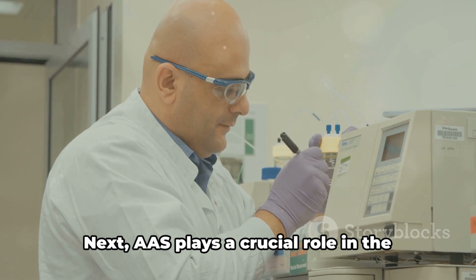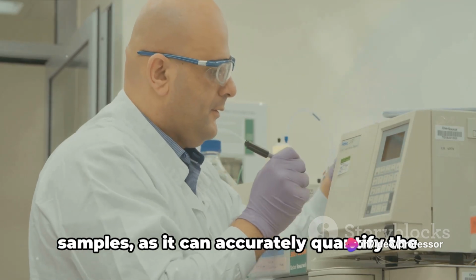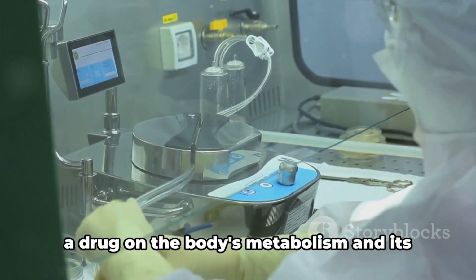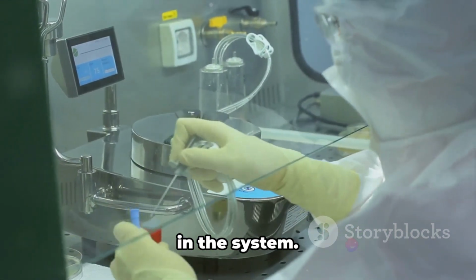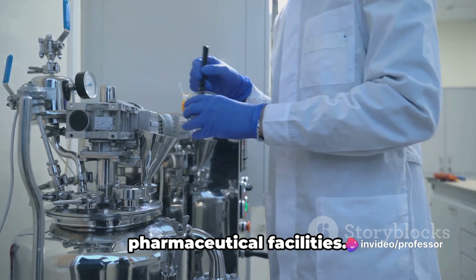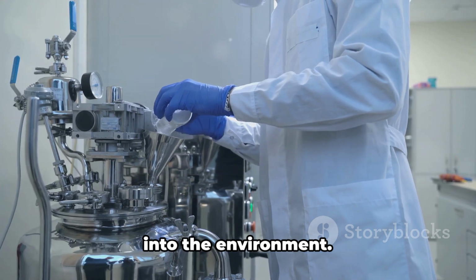Next, AAS plays a crucial role in the research and development of new drugs. It assists in the analysis of biological samples, as it can accurately quantify the concentrations of various elements. This helps in understanding the effect of a drug on the body's metabolism and its potential interactions with other elements in the system. Finally, AAS is also used in environmental monitoring within pharmaceutical facilities. This ensures that the manufacturing process doesn't release harmful substances into the environment.